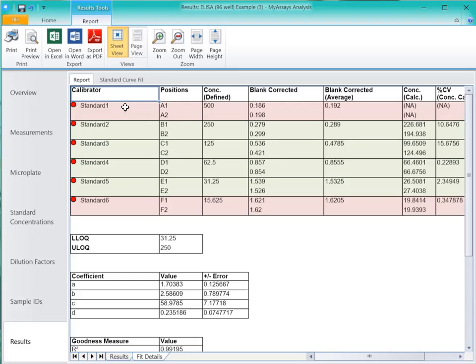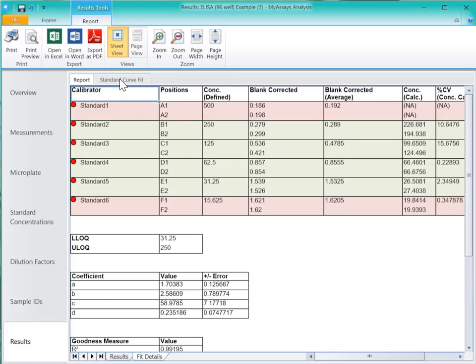We can also see the various parameters calculated from the curve, as well as the curve fit equations. If we click on the Standard Curve Fit tab, we can see an interactive chart that will allow us to optionally exclude outliers or save the curve to the library.